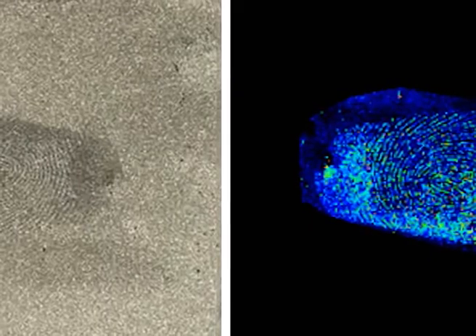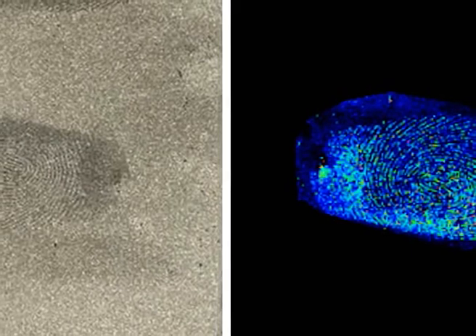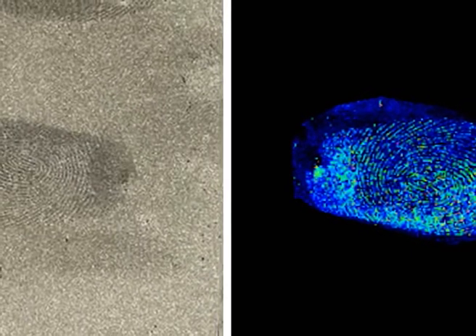About 1 gram of 8-anilino-naphthalene 1-sulfonate is dissolved in 5 ml of methanol, and the resulting solution is mixed with 200 milliliters of freon. After the two layers separate out, molecular sieves are added to remove the methanol, as it causes running of ink on scripted documents. After spraying the test solution on sample fingerprints, the surface is allowed to dry for about 1 minute. It is then examined under long wavelength ultraviolet light, whereupon fingerprints are rendered visible.